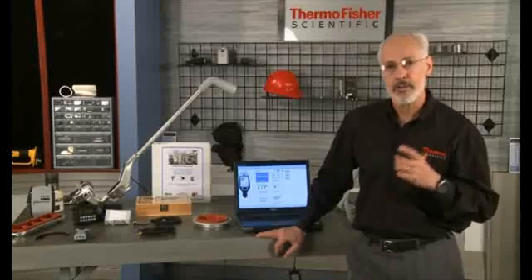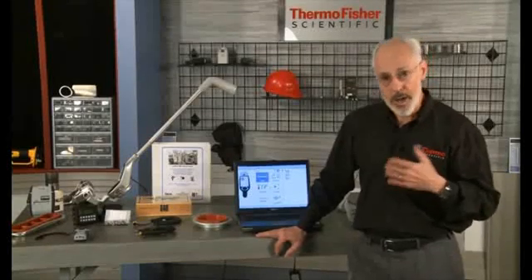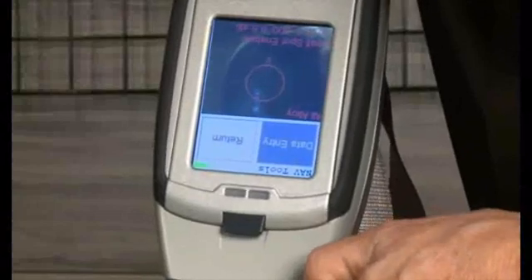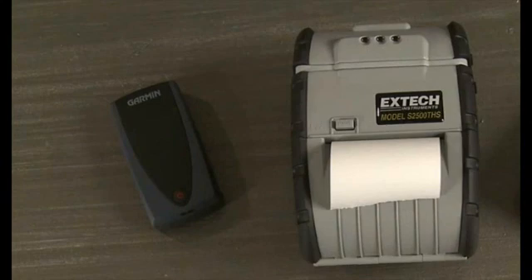The complete Thermo Niton Analyzer's PMI alloy testing system includes the latest advancements in Niton analyzer capabilities, plus refinery-specific testing accessories that augment the use of XRF, as well as extending the reach of the technology. Examples of the incremental capabilities include Weld Spot, a collimator that narrows the X-ray focus to isolate welds from the base materials. CamShot, an internal CCD camera to aid in analyzer positioning and to document sample location for traceability. Direct Read Electronic Position Indicator, EPI, data logging buttons. Real-time GPS integration. Bluetooth wireless portable printer for on-the-spot hard copy documentation of tests.